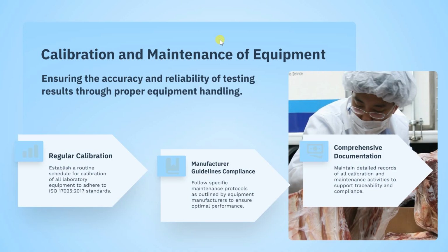If the equipment is always in use, it means it will need calibration or maintenance very often. Again, we also have to remember what we call preventive maintenance. If the equipment is left there without working for maybe 2 or 3 years, 5 years, without operating, this equipment is going to get damaged.